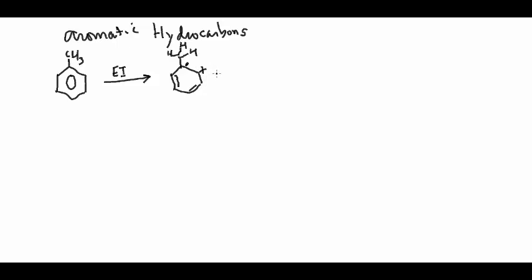Now, this radical cation is subject to a loss of a hydrogen atom from the methyl group. Let's see, homolytic cleavage basically.